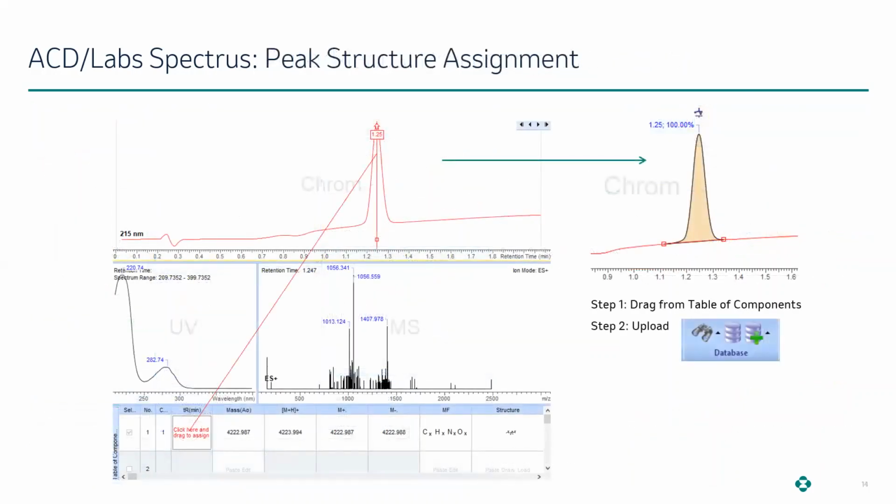Okay, and assigning peaks manually is especially useful for more complex molecules, such as large peptides, where perhaps the parent mass is defined in the SD file, but in the actual analyses, perhaps the M/3Z is more prevalent.